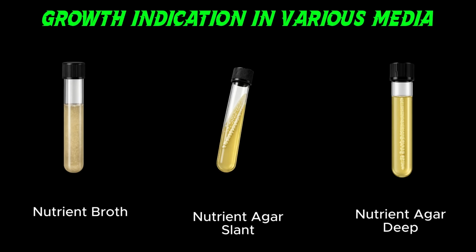If aseptic technique has been followed correctly, only the intended microorganism will grow, and there will be no unexpected colonies, unusual colors, or growth patterns. This confirms that the culture transfer was successful and the culture remains pure, free from contamination.